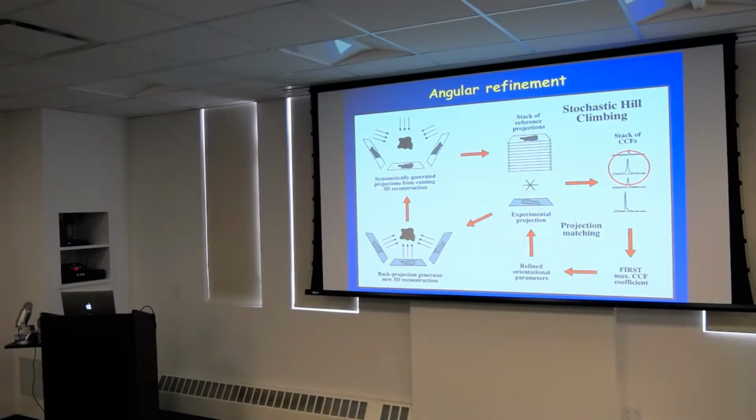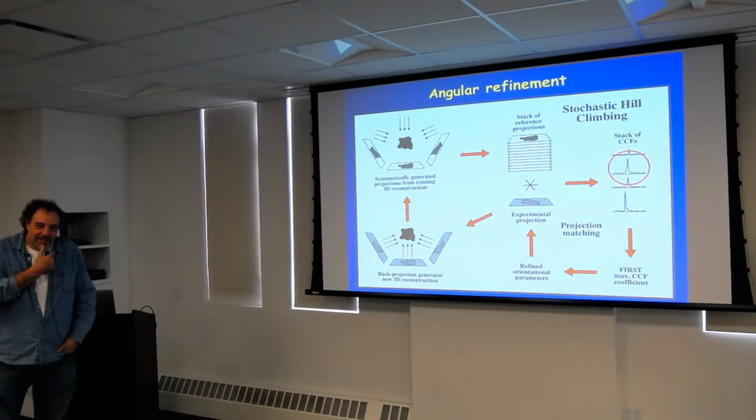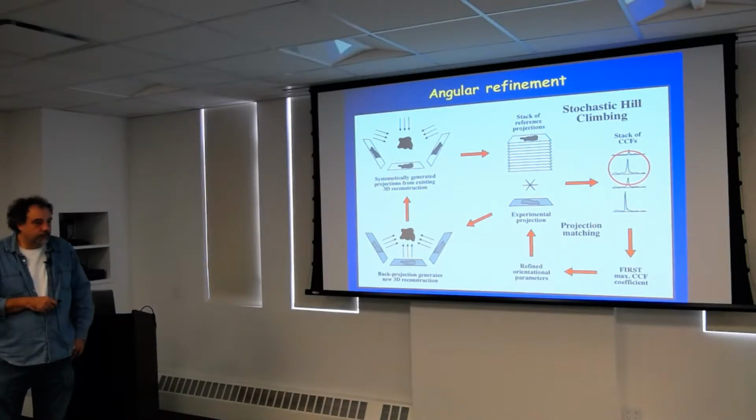I'm talking about validation. After we have the 2D averages, we do the 3D reconstruction. After that, we go back to the raw data. Yes. And here, are we taking all the images or just a subset of the images?